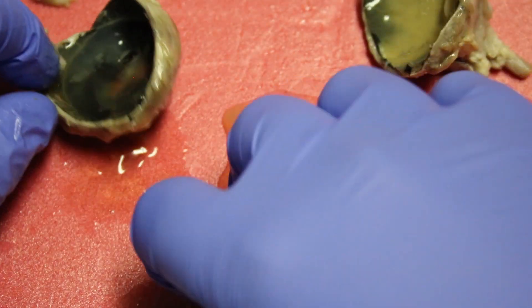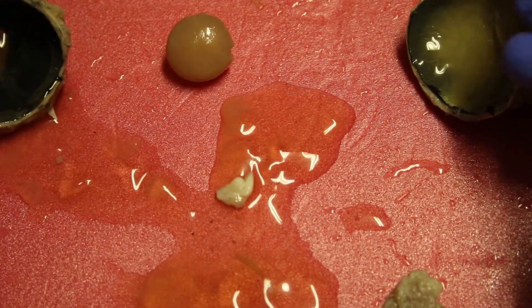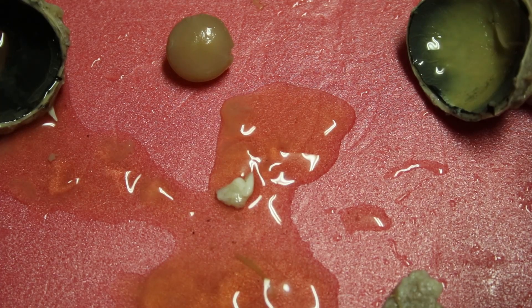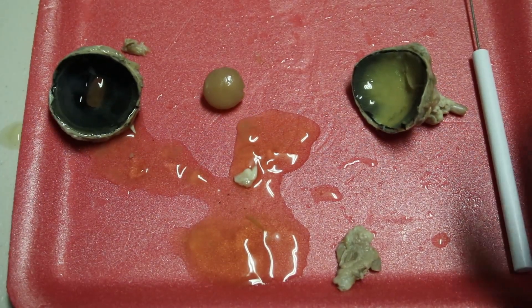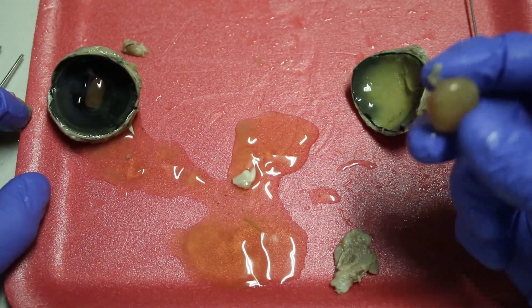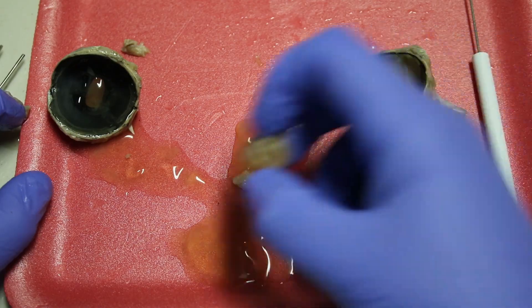We can make some observations about the structures we see up to this point: the vitreous humor, the back half of the eye, the front half, and the lens. A great method for making observations that I like to use is called I Think, I Notice, I Wonder — I often refer to it as TNW observations in my videos. I will leave a link to a graphic organizer you can use. We'll let the lens dry out overnight and I will show you what it looks like when you hold it up to text.